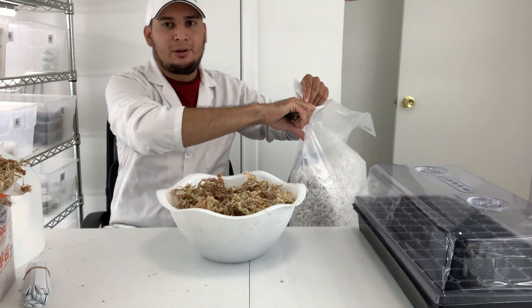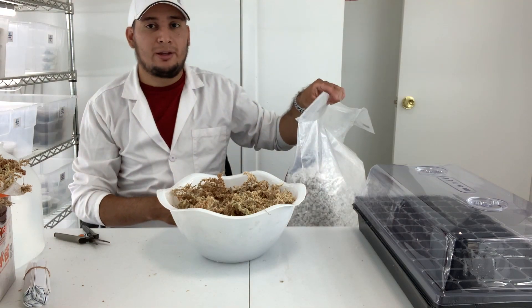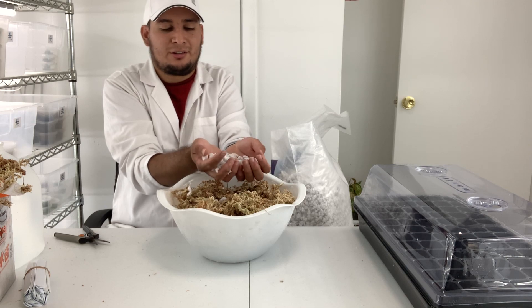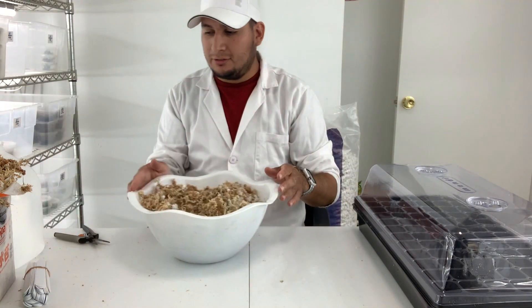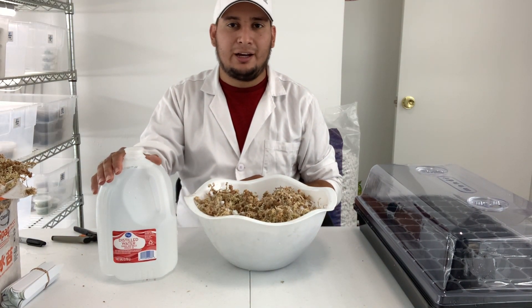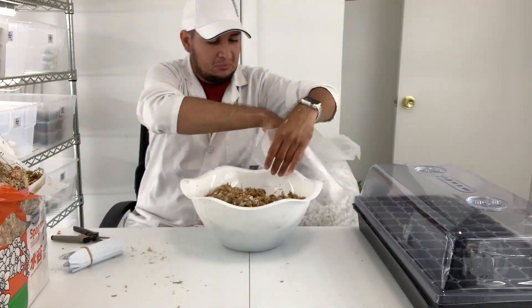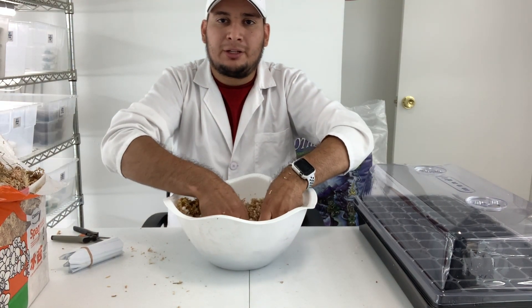When working with perlite you probably want to use a mask — an N95 — because it's very very dusty. This perlite is very coarse, you can really see it. Now I'm using filtered water from my RO filter.